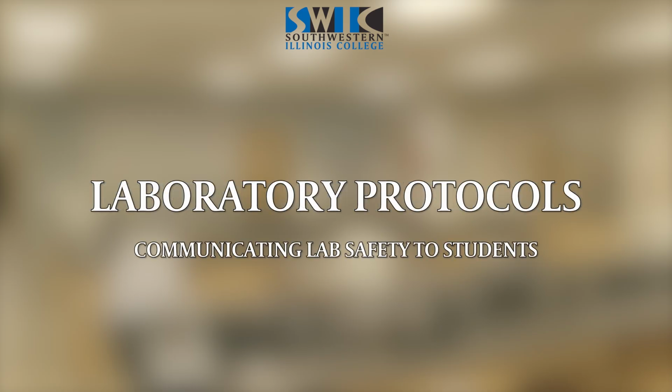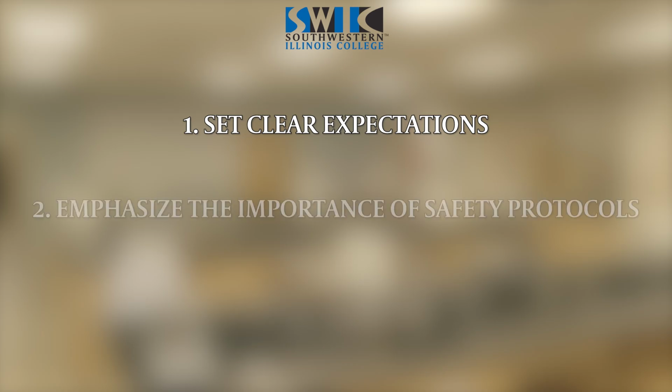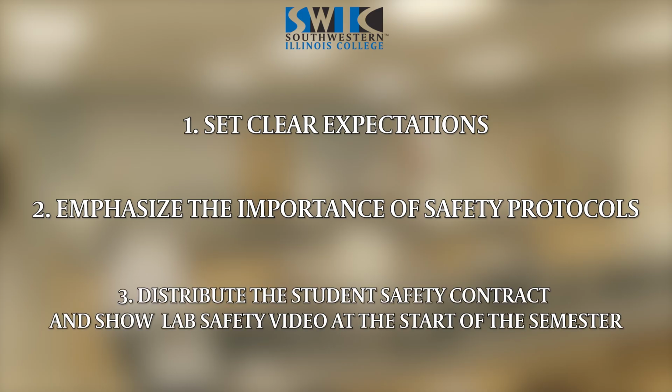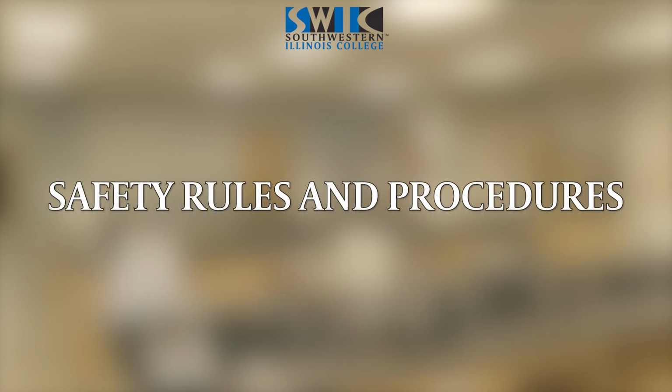When it comes to teaching lab safety, effective communication is key. Start by setting clear expectations. Emphasize the importance of safety protocols and make sure your students understand that safety is a top priority. Distribute the student safety contract and be sure to show the lab safety video at the beginning of the semester. Ensure your students know how to use safety equipment, where it's located, and what to do in case of an emergency. Remember, practice makes perfect.